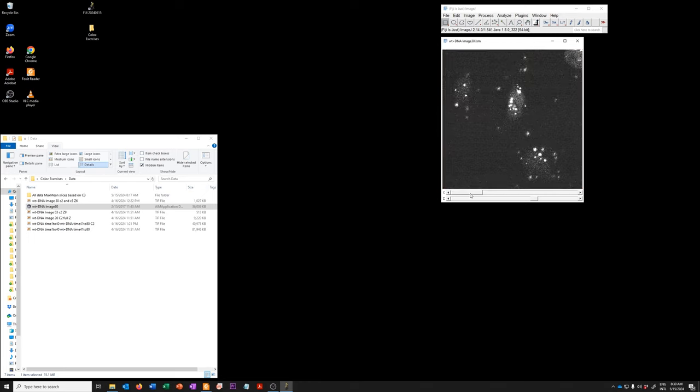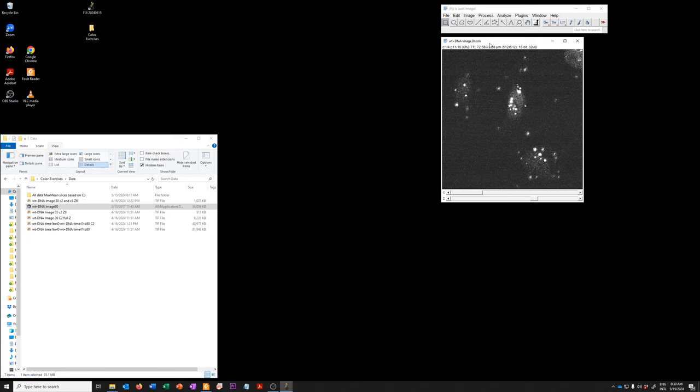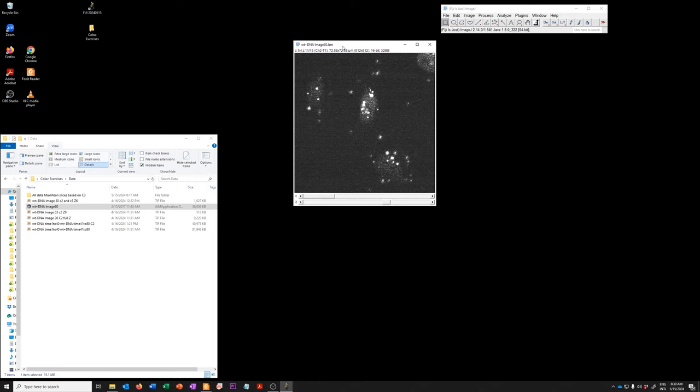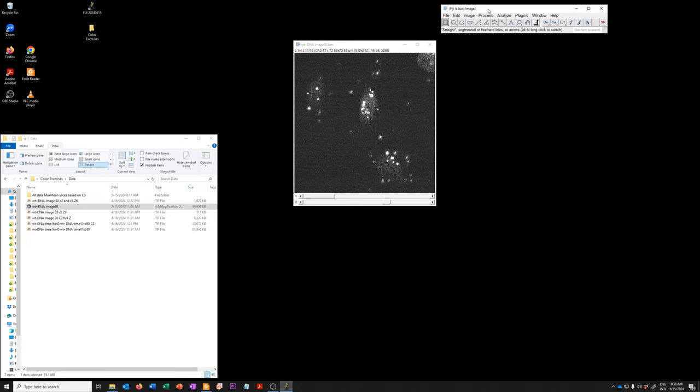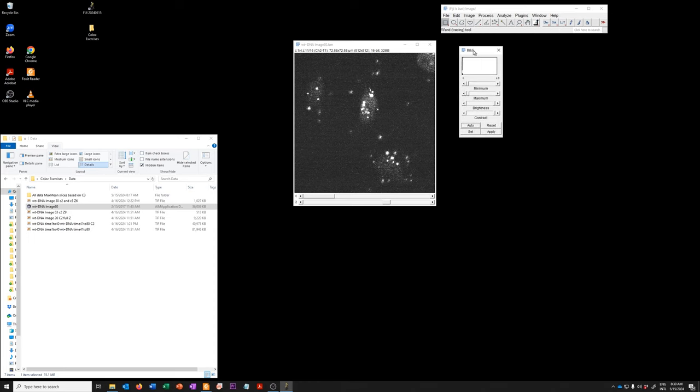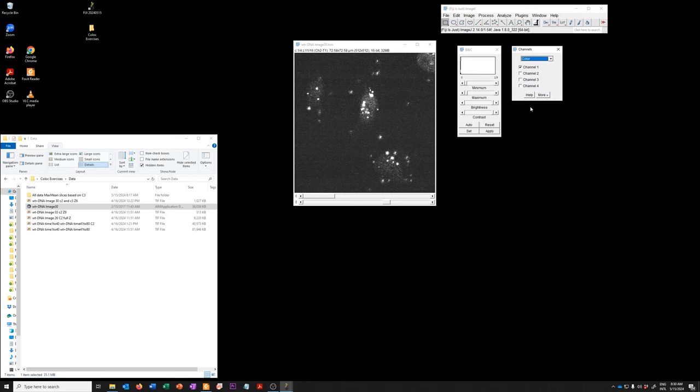There's a few things that I usually open when I have something like this to navigate the data more appropriately. One is the brightness and contrast menu, which I open with CTRL-SHIFT-C. The other is the channels tool, which I open with CTRL-SHIFT-Z, as in zebra.